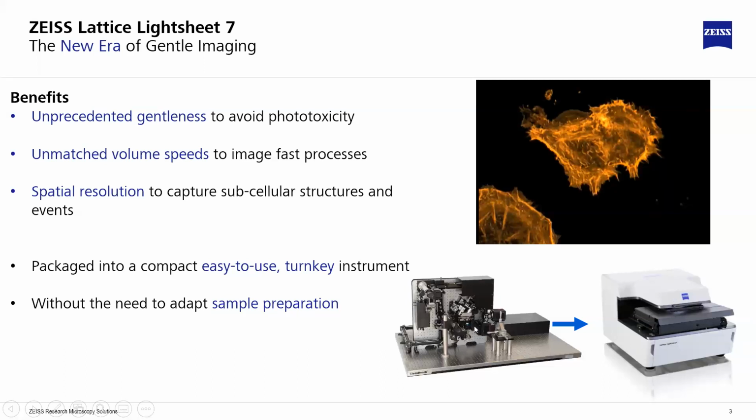These are some of the things that we were trying to combat with the implementation to make it much more approachable as a technique. So we've re-engineered the configuration from that upright system into this inverted platform that can handle a wide variety of sample carriers, including multi-well plates and chamber slides. And I'll talk a little bit more about that at the end of the presentation here.